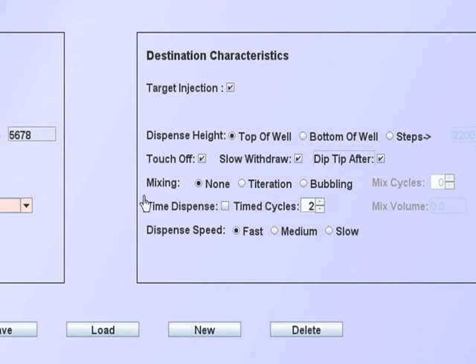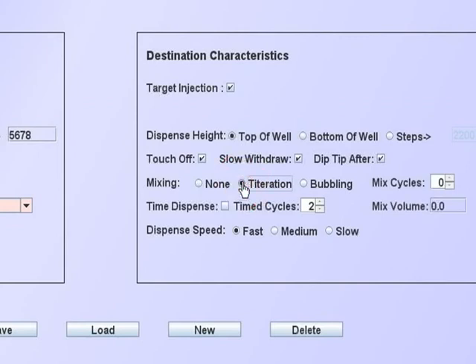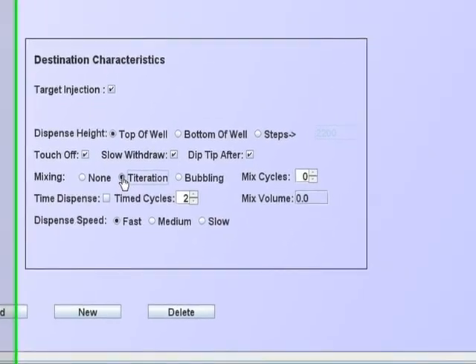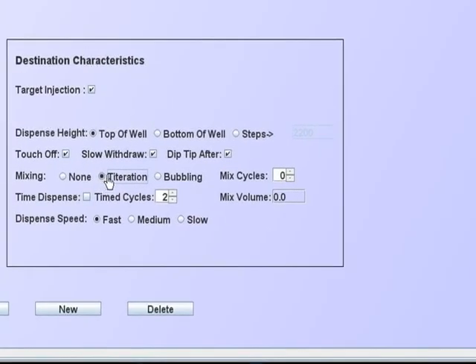There are two forms of mixing the contents of a well after a dispense. Titration is aspirating a volume from the bottom of the well and dispensing it at the top of the well for the number of cycles that are selected.